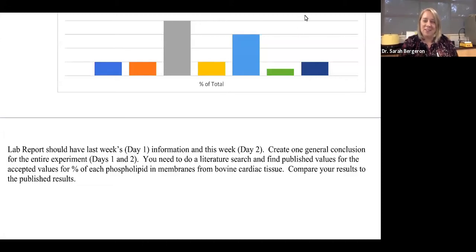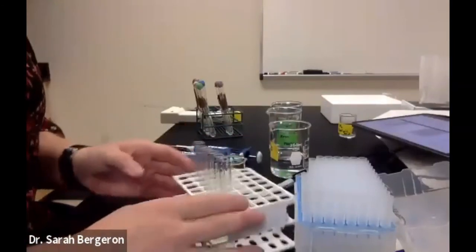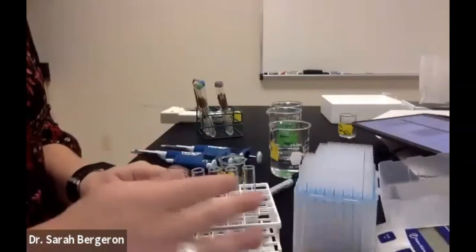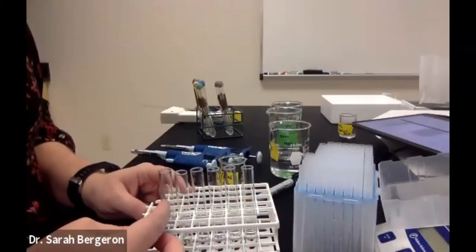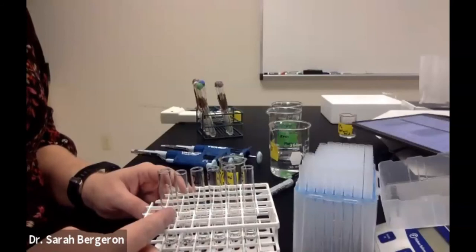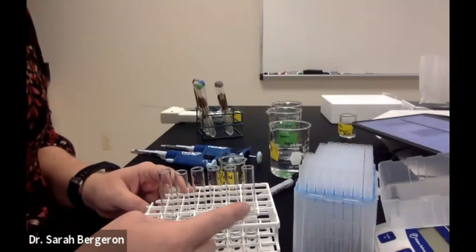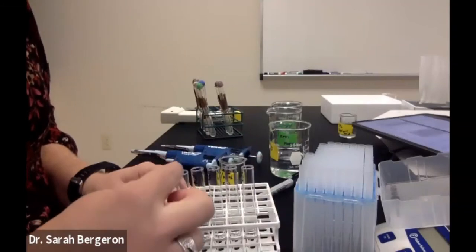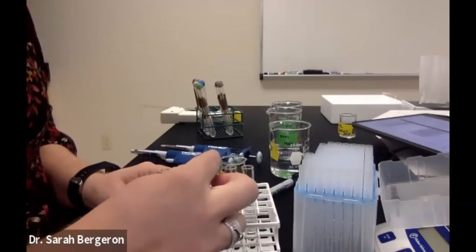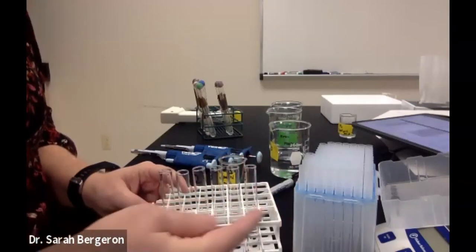Okay, so here's our experiment. I have my 5 samples here that will have my phosphate standard, and then I'm going to have my blank. All I've put in so far is water. So I need to add, if you're following along on that little handout, I did 3.3 milliliters in my 0, then 3.2, 3.1, 3.0, 2.9, and 2.8 mils of water in each of these standards.